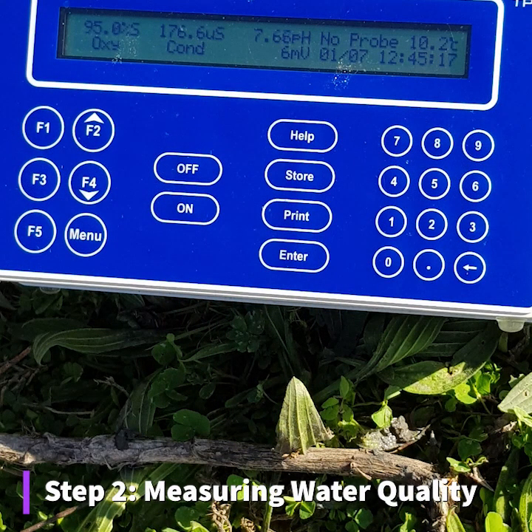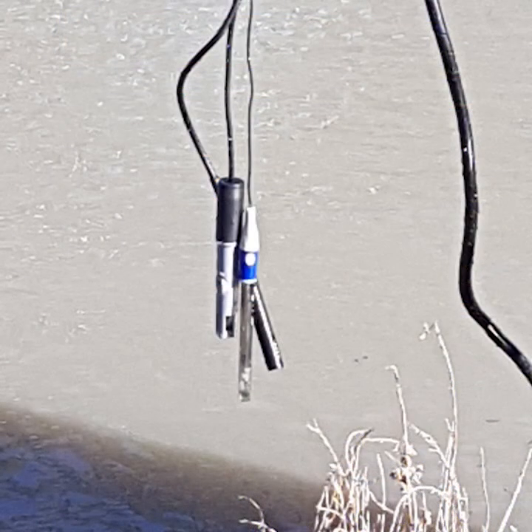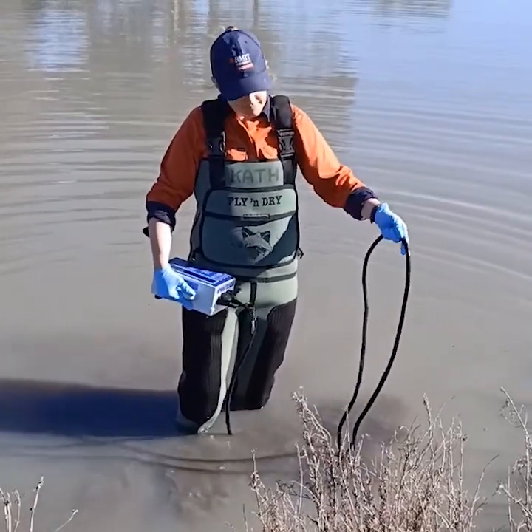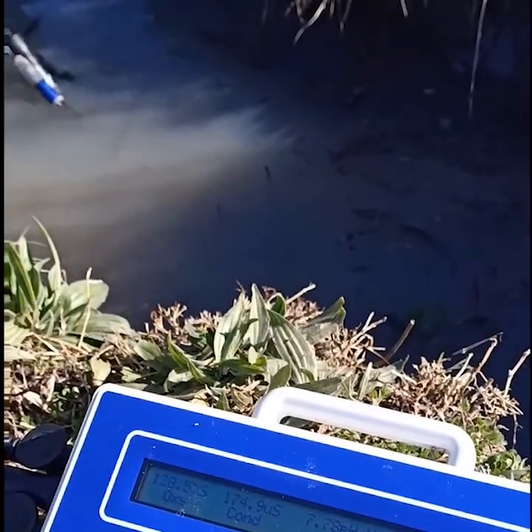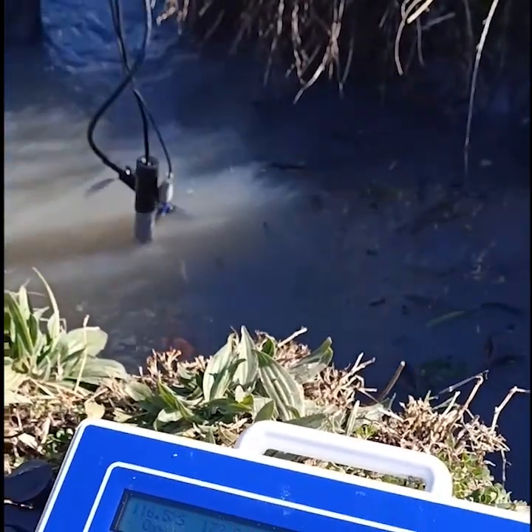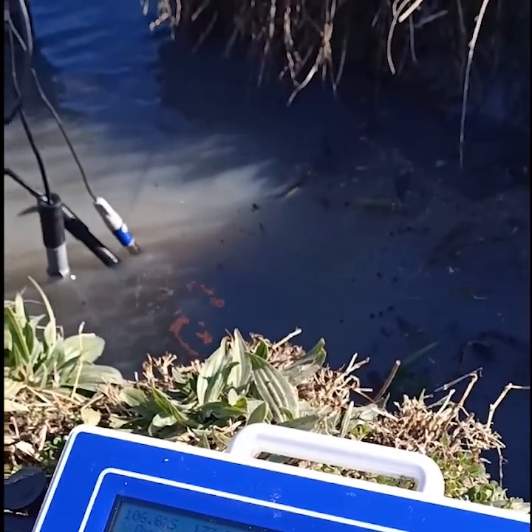Now we are ready for the fun part, actually measuring the water quality. So we are using a multi-probe that will measure conductivity, pH, water temperature, and dissolved oxygen. In a wetland, such as in this picture, you will need to enter into the wetland and find a spot where it hasn't been disturbed and put the probes in. As there's no moving water, you will need to gently move the probes so that you can get an accurate reading. If you are in a river that has flowing water, then you need to make sure that you are standing downstream of the meters so you're not disturbing the water.